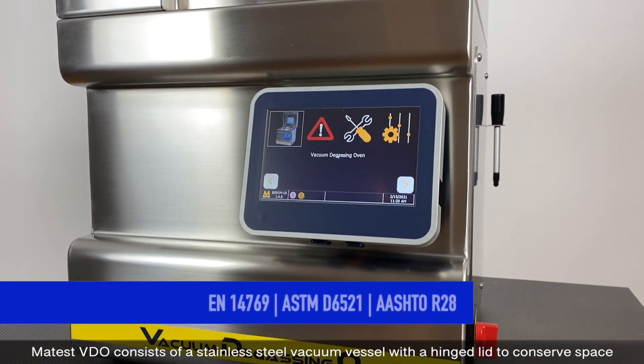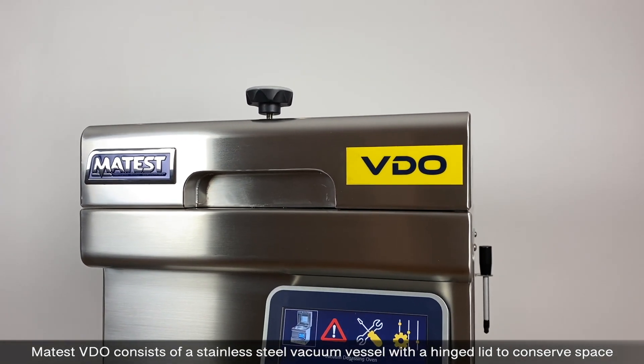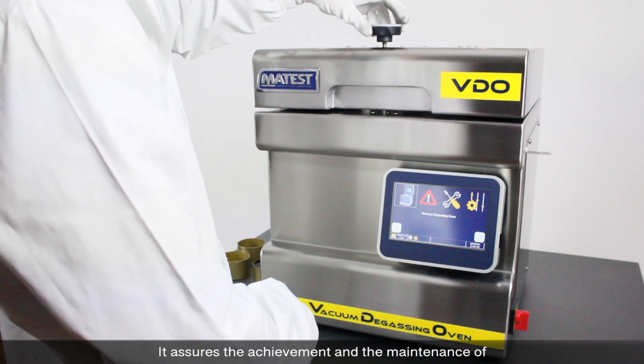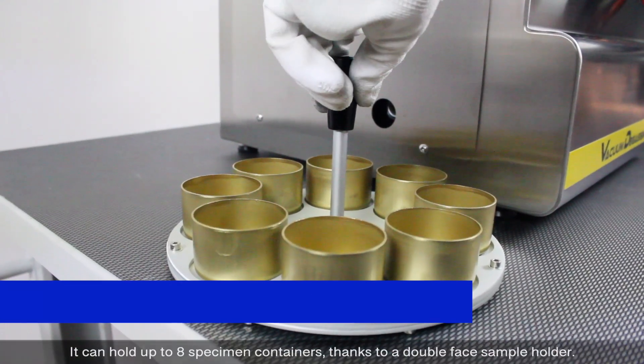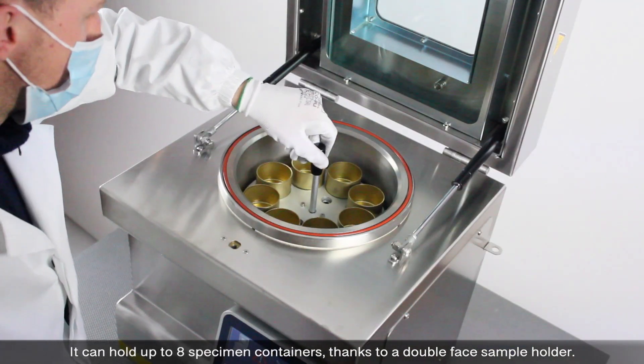Maytest consists of a stainless steel vacuum vessel with a hinged lid to conserve space and access the vacuum chamber. It assures the achievement and maintenance of the required pressure for vacuum according to the standards, and can hold up to eight specimen containers thanks to a double-phase sample holder.